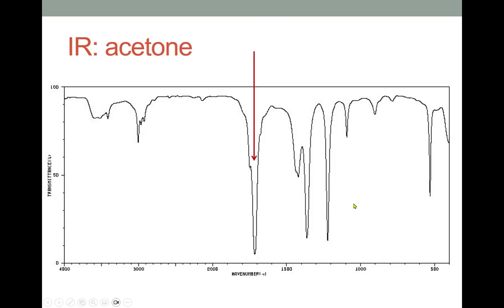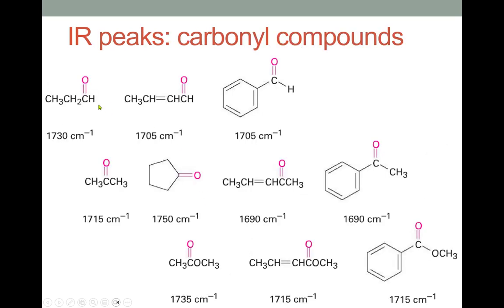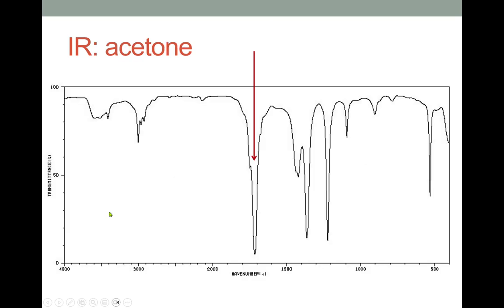As a real example, here's acetone. So acetone is right here. The textbook would say 1715, and we see that strong peak here. This is the same one we saw earlier with maybe a little bit of water in the sample.